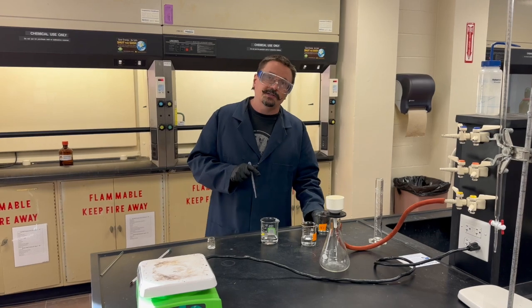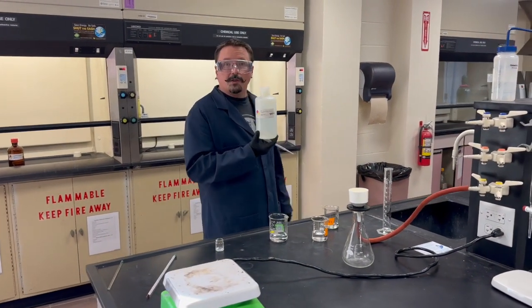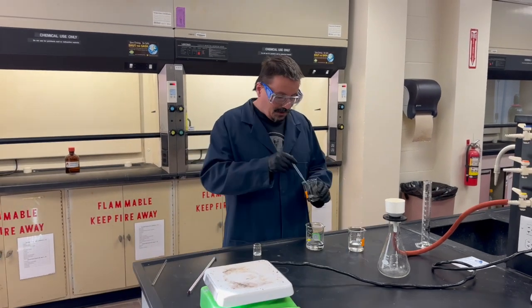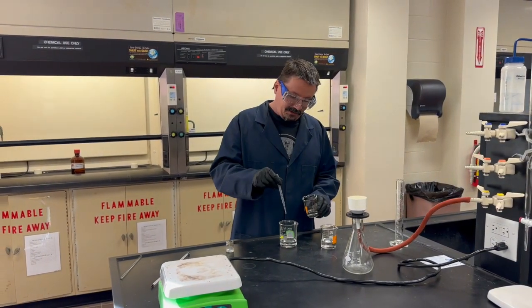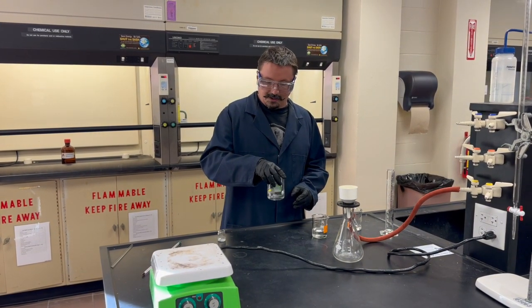Get your 6 molar HCl from one of the hoods and add about 20 drops of that to make the solution more acidic and to help it dissolve.